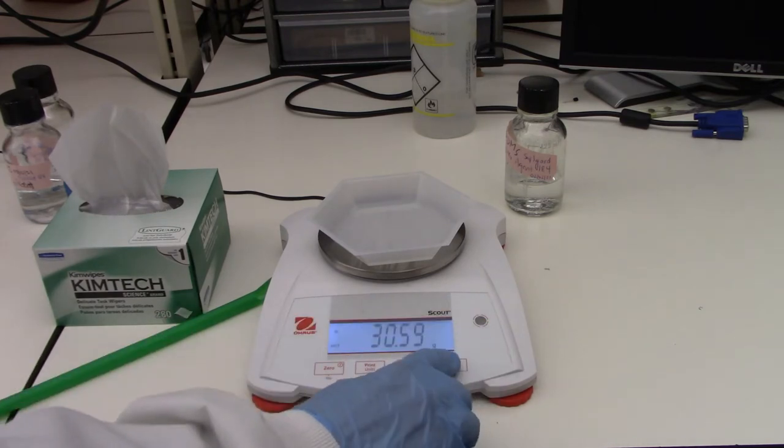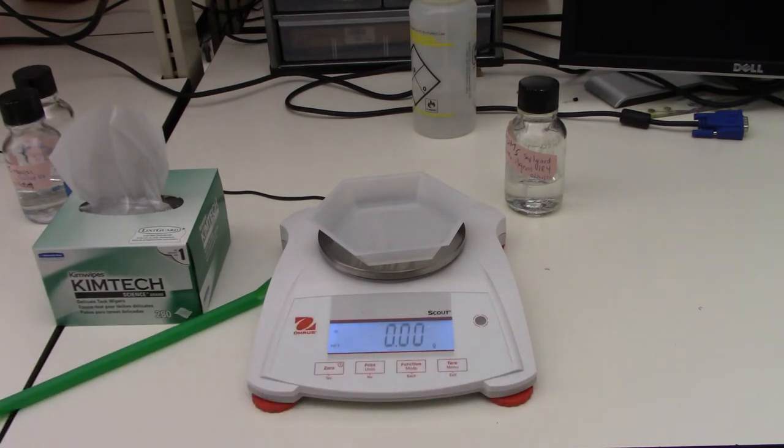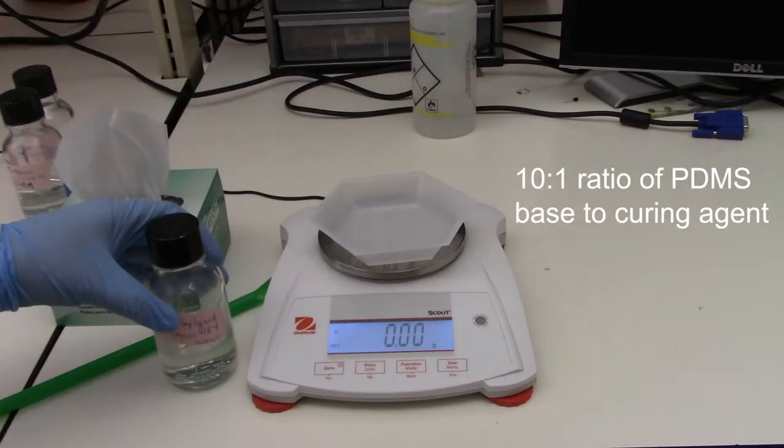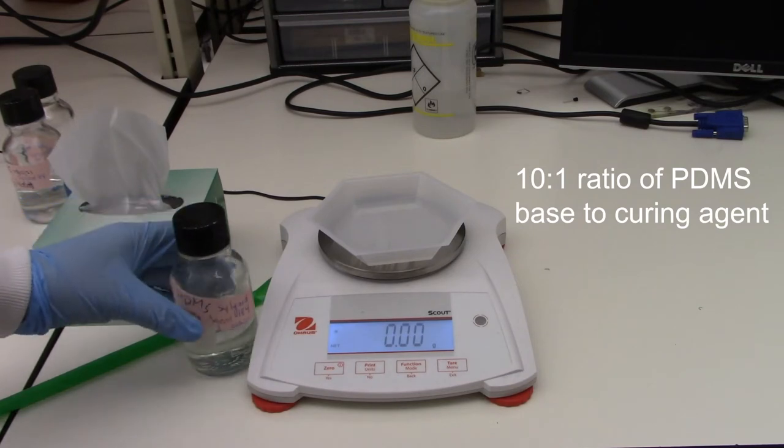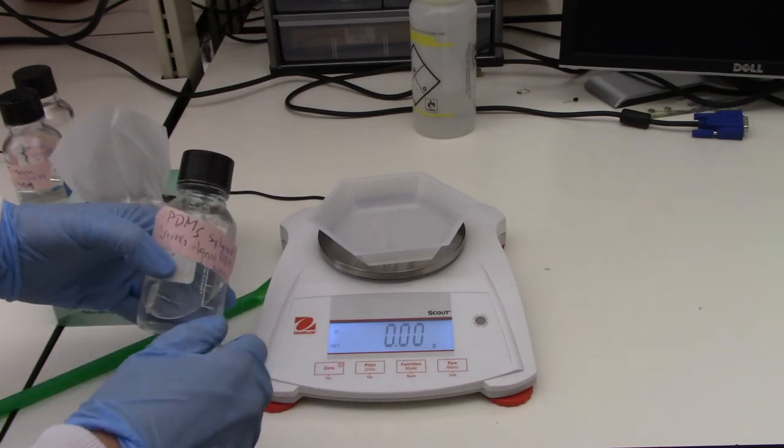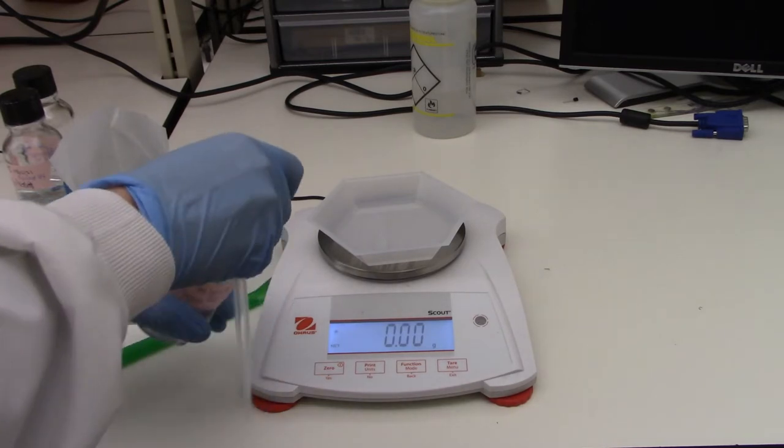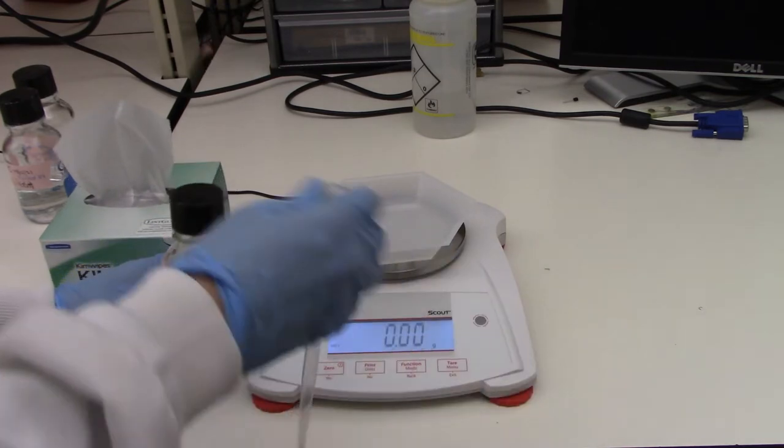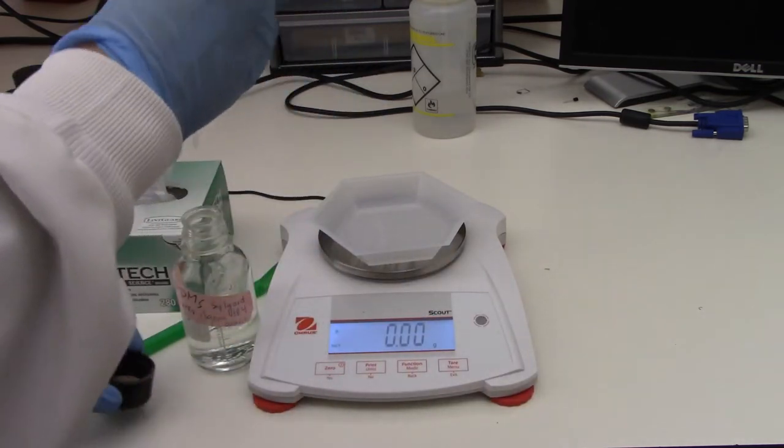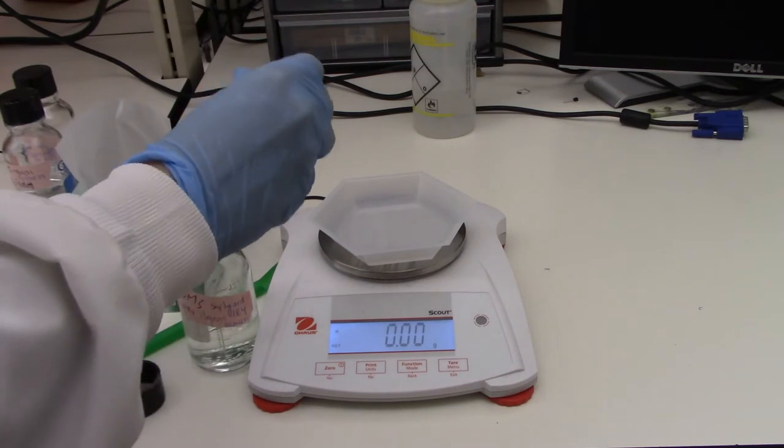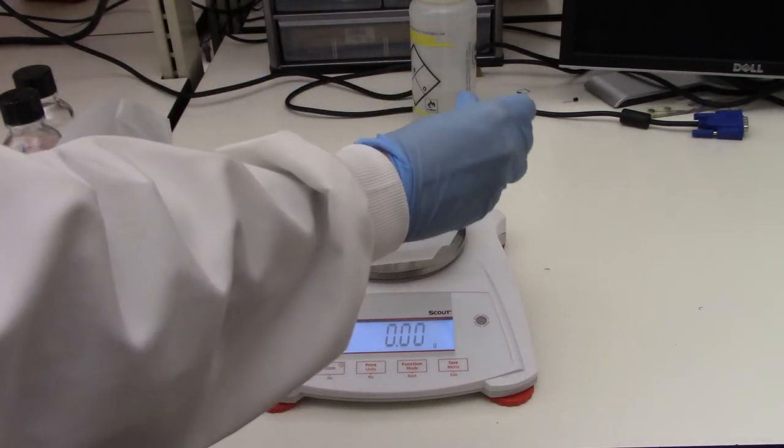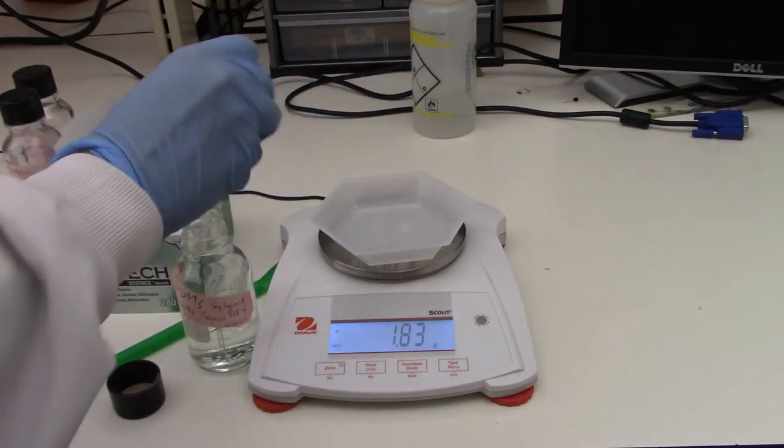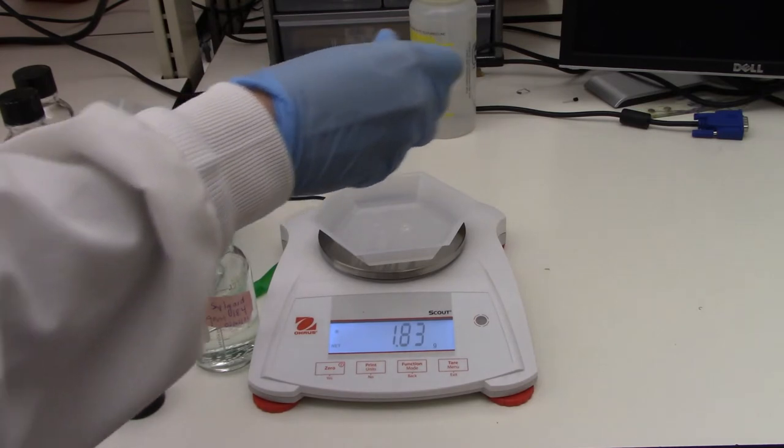So the next one I'm going to do is tare. And then I'm going to take my curing agent here. And in comparison to the base, the PDMS base, the curing agent is less viscous. So it's more of the consistency of water. So instead of pouring, I'm actually going to use a transfer pipette. And we want to measure out three grams. Yeah, that's pretty good. So you can see that went up pretty fast. So we'll go a little bit less on the next amount.